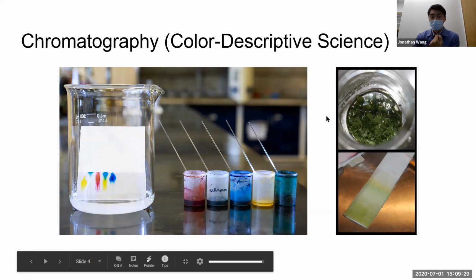This is also classically done with mushed up plant parts. You can separate the chlorophyll components in the tissue paper as well. This is known as paper chromatography.